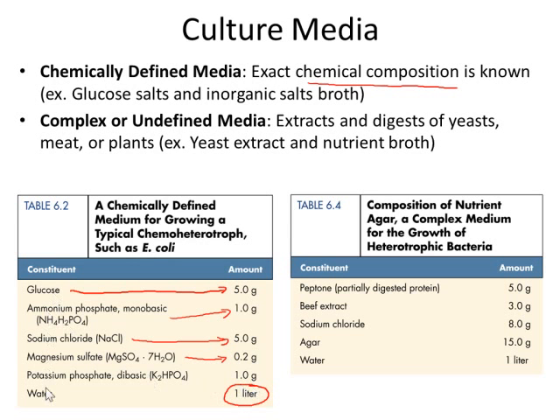Now, if you look at the recipe, will this defined medium be a solid or a liquid medium? That's right, it's going to be liquid. Due to the absence of what substance? That's right, there's no agar in the recipe. Now, why would I use a chemically defined media?